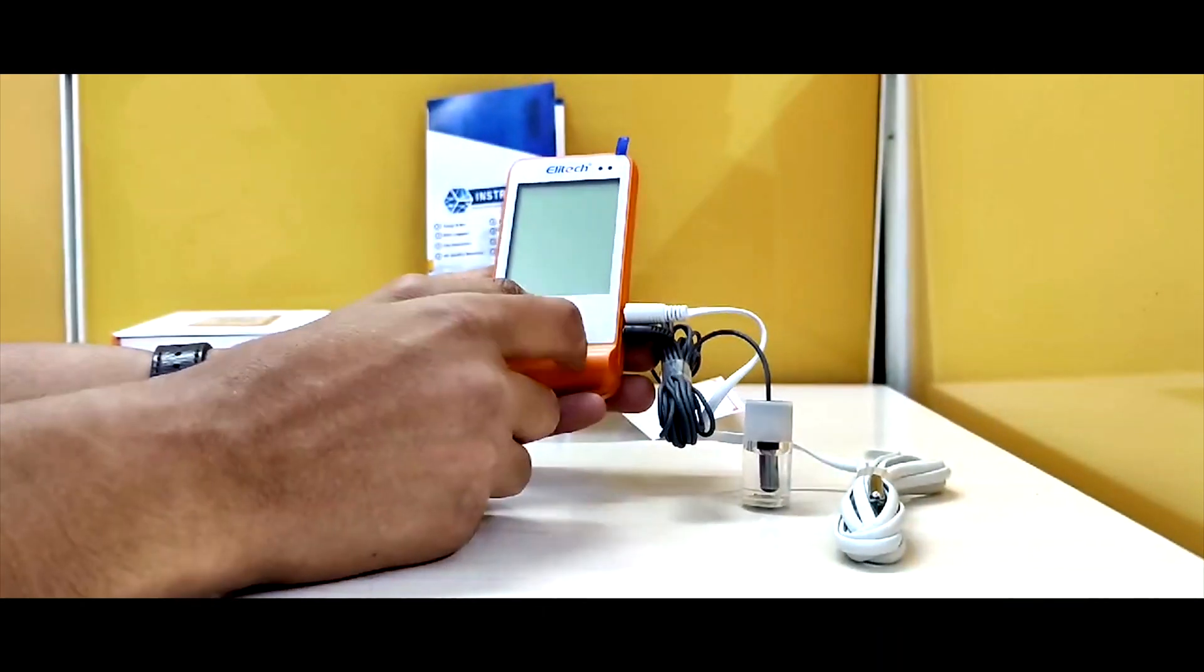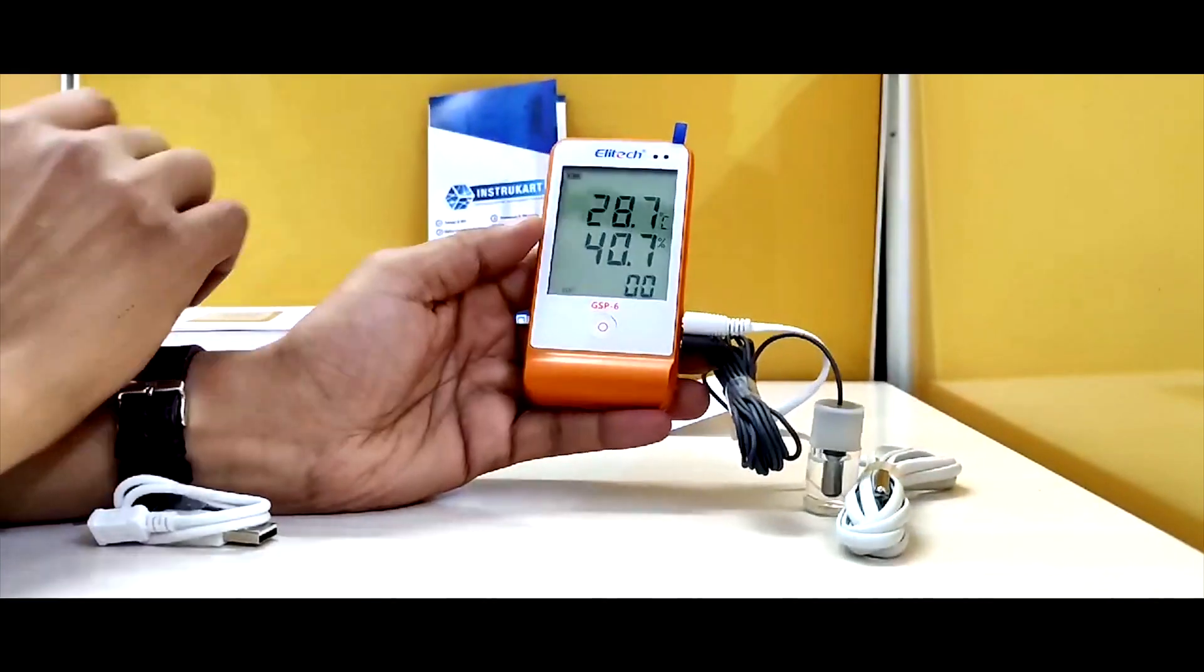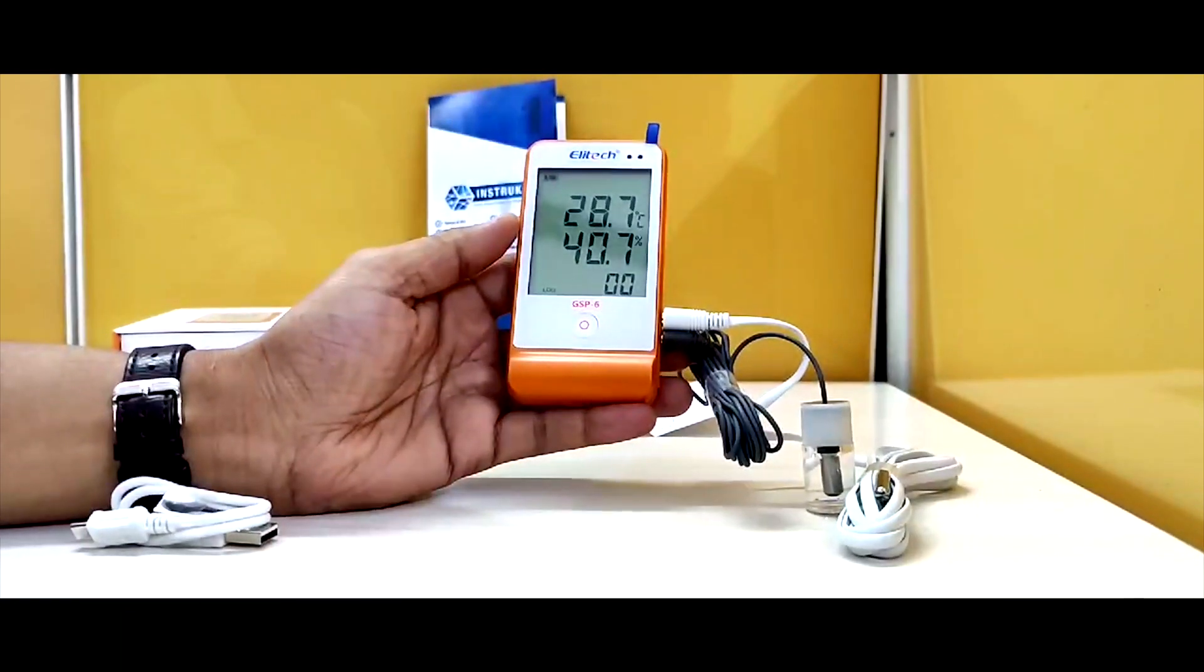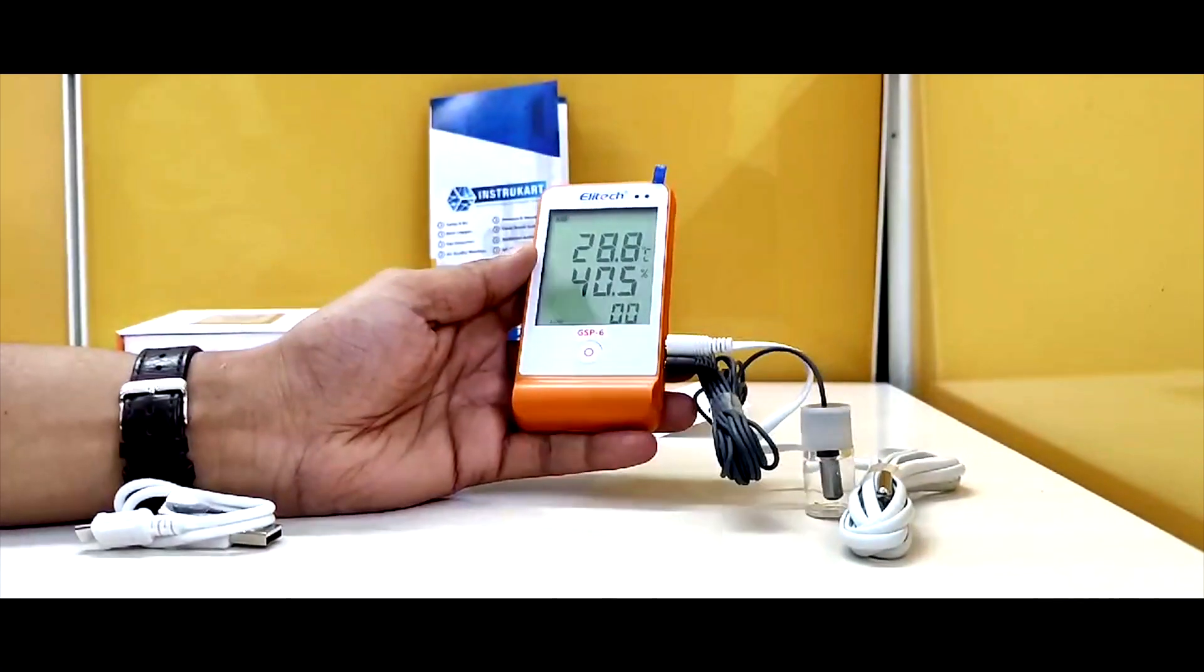Otherwise in GSP6, the normal probe comes for the temperature reading. Now if you can see, this has a very large probe. It has a 2.8 inch LCD probe which shows the temperature, humidity, and the logs.